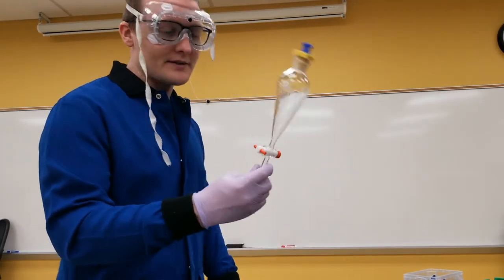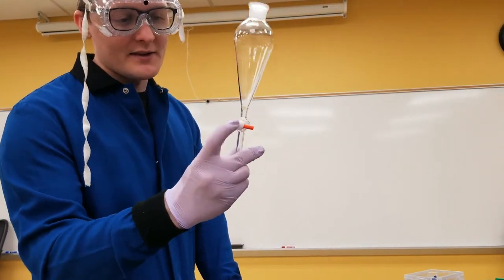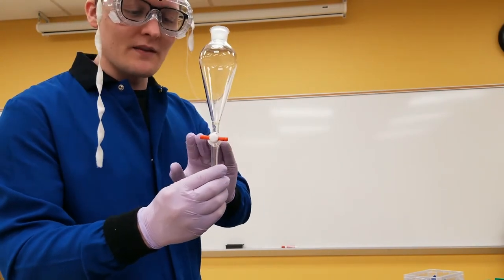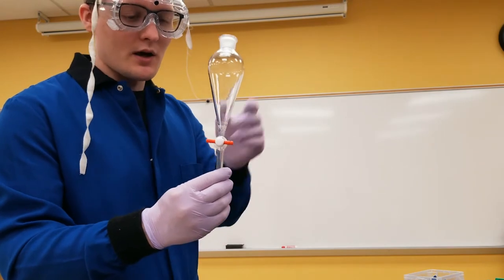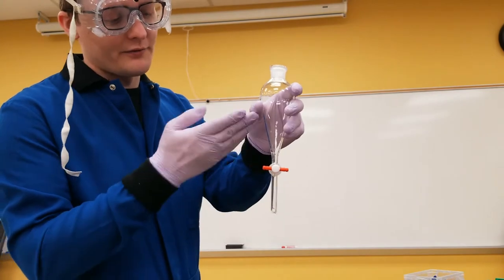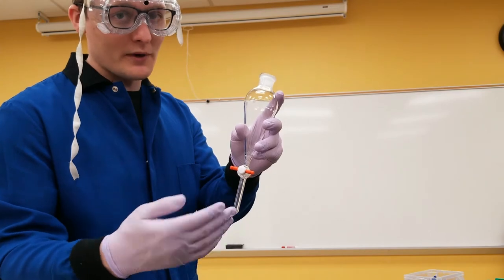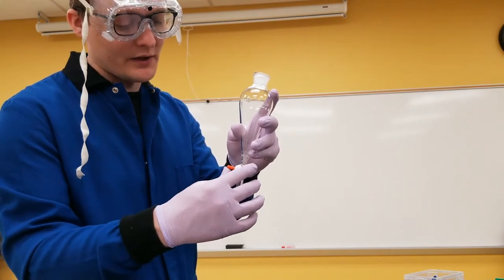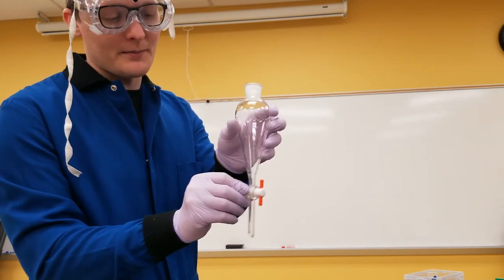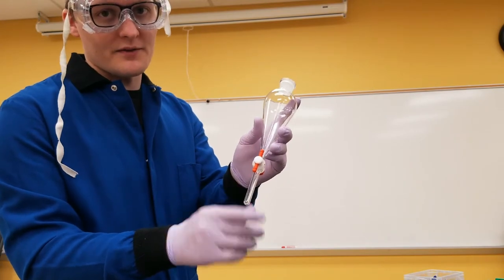So here's my separatory funnel. The first thing I want to introduce you to is this, which is the stopcock. As it is right now, this is in the closed position. I like to think of it as like a little wall which is blocking the liquid from flowing out. In order to let liquid flow later when I'm trying to collect my layers of solvent, I will turn it vertically and that allows a little hole in the stopcock to allow flow through the stem of the sep funnel down here.